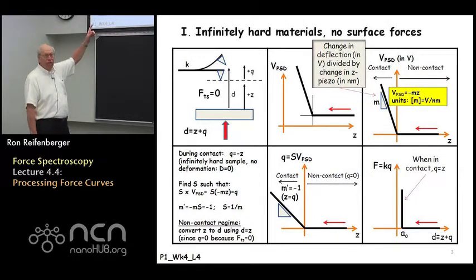So very often when you get raw data, the raw data could be floating in space. I say floating in space because there's no Z equals 0 associated with that data. The data could be offset from 0 volts, right? The offset is just a function of how carefully you aligned the laser spot on your photodiode before you actually took the experimental data.